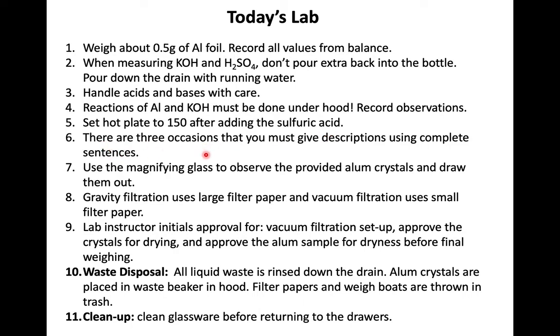There are 3 occasions that you must give descriptions using complete sentences. Use the magnifying glass to observe the provided alum crystals and draw them out in detail. Gravity filtration uses large filter paper, and vacuum filtration uses smaller filter paper. Your lab instructors should initial for approval of your vacuum filtration setup. They should approve your crystals for drying and approve the alum sample for dryness before the final weighing.